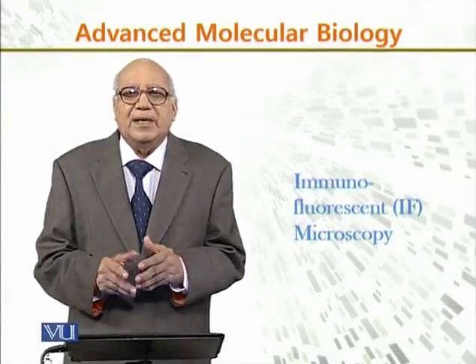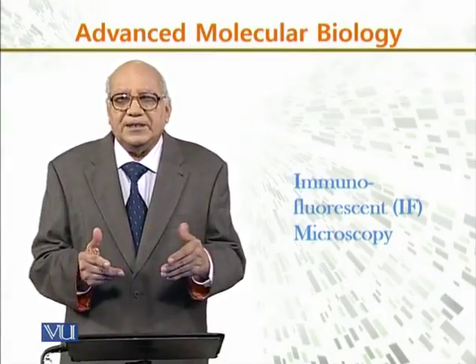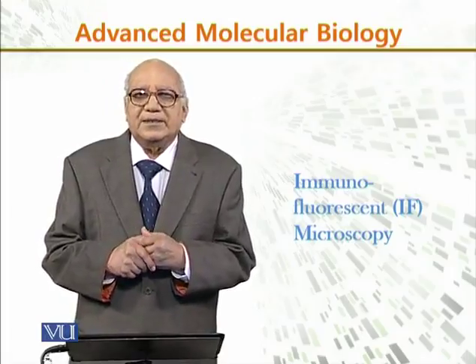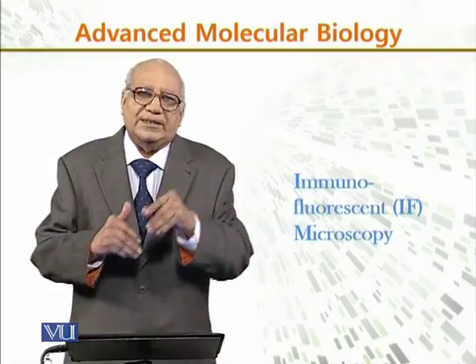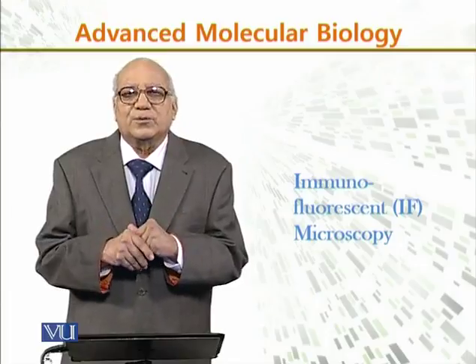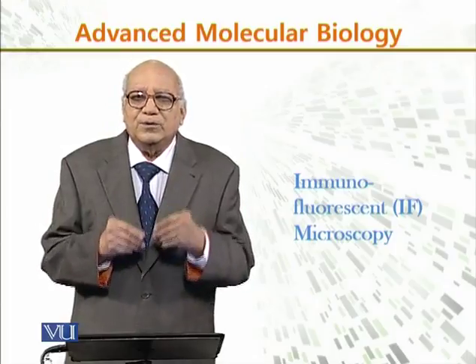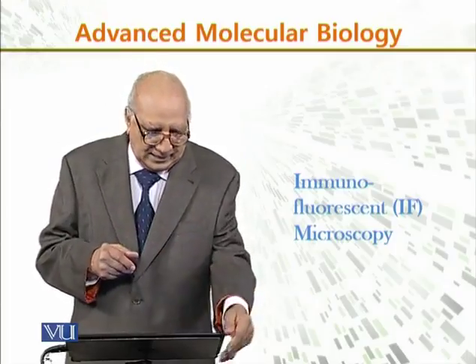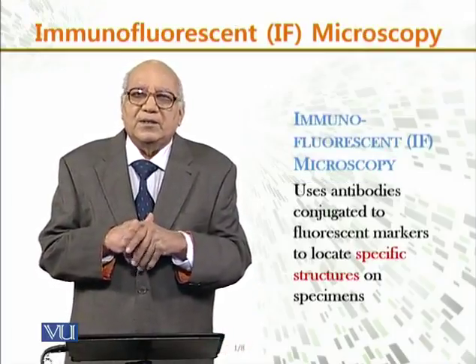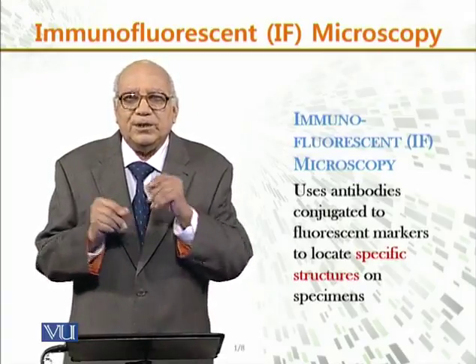The different methods which are used for determination of antibodies and antigens, we will discuss another very precise and important technique, and that is immunofluorescent microscopy, which is briefly known as IF. In this immunofluorescent microscopy, we use antibodies which are conjugated to fluorescent marker.